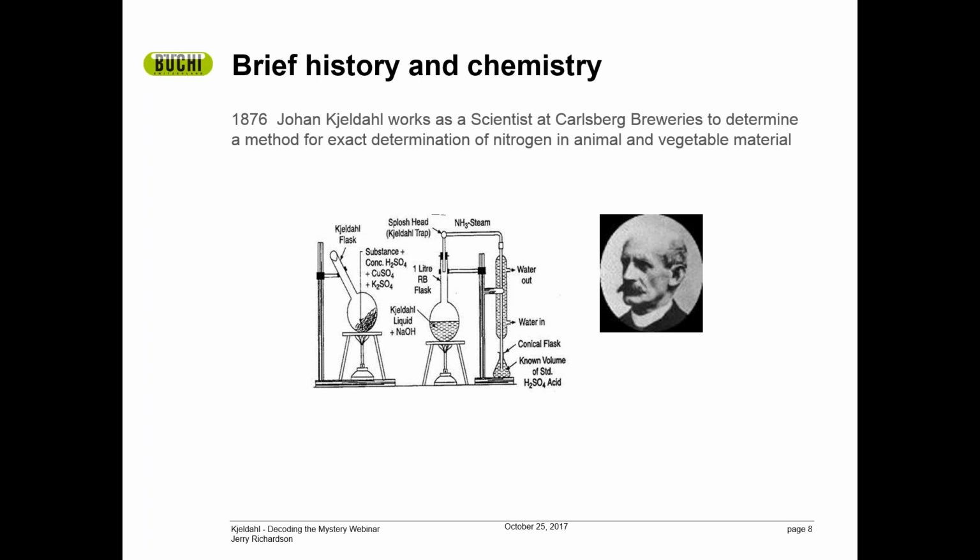All right, so moving on, when we talk about the chemistry itself, it is well over 100, approaching 150 years old. And ironically enough, these are still the same basic processes: digestion, distillation, and then collection at this point. Titration came a little bit later, and we'll talk about that here in a little bit, as well as being separate. Okay, so when we talk about digestion, that's going to be our first point.